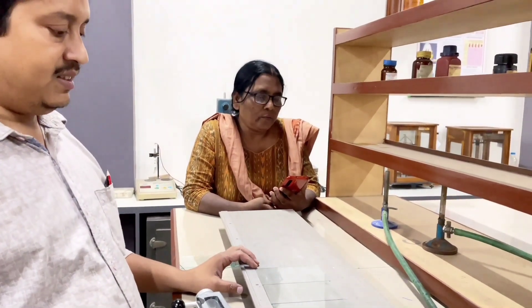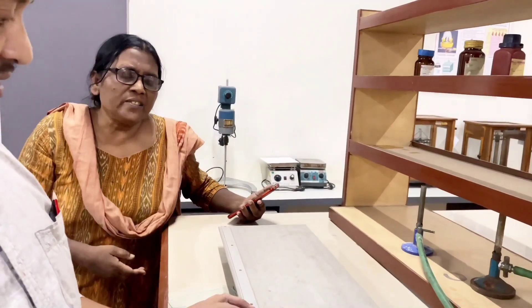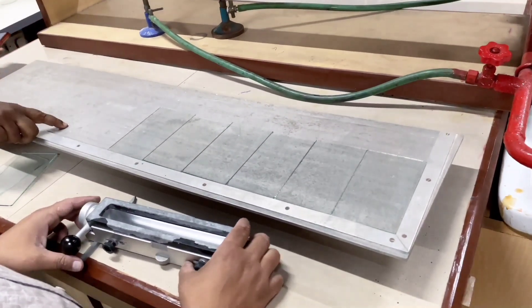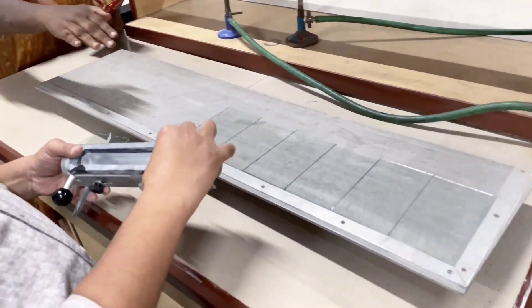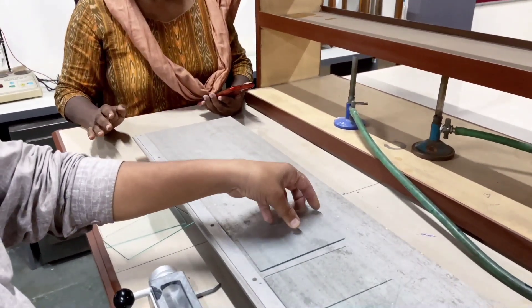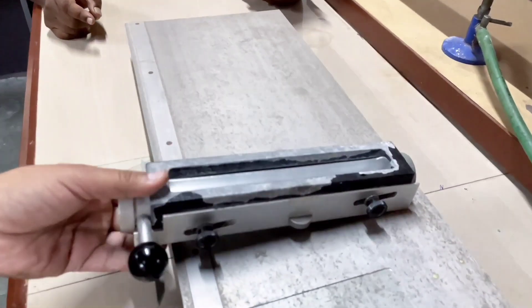In today's practical we are going to show you the preparation of a TLC plate. The certain things required for making a TLC plate: the platform you can see here, over which there are some glass plates on which the slurry will be poured. This tubular thing you are seeing is your spreader.